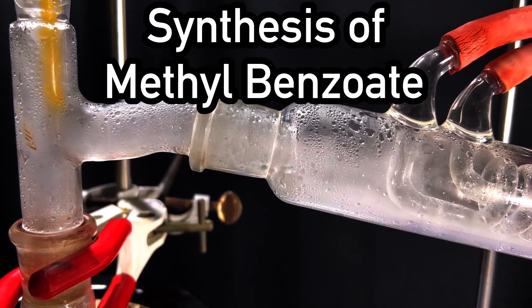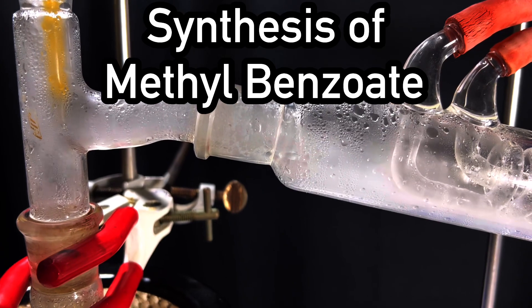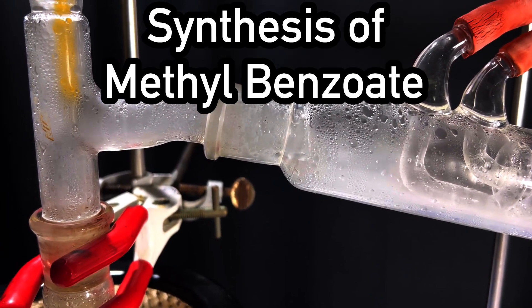Hello friends, in this video we will synthesize methyl benzoate via the Fischer Esterification Reaction.